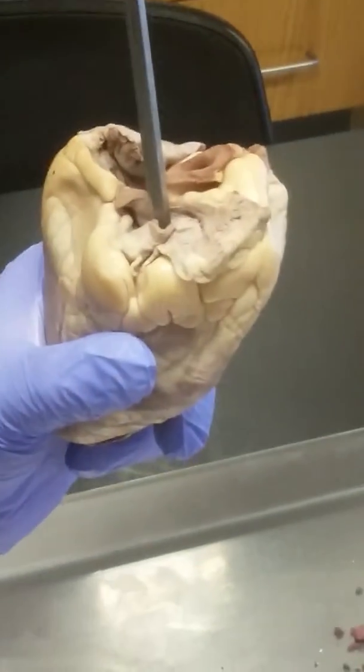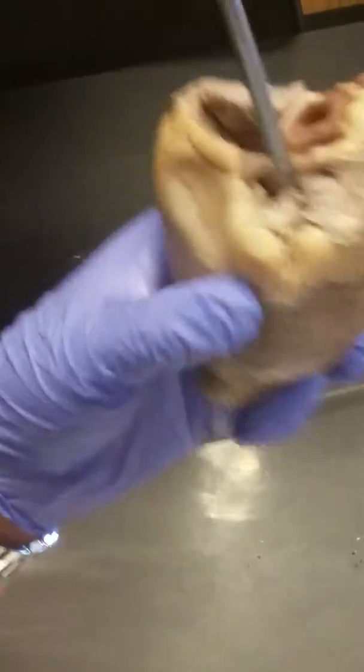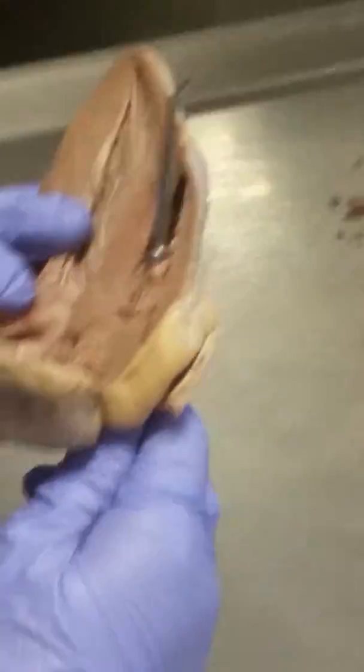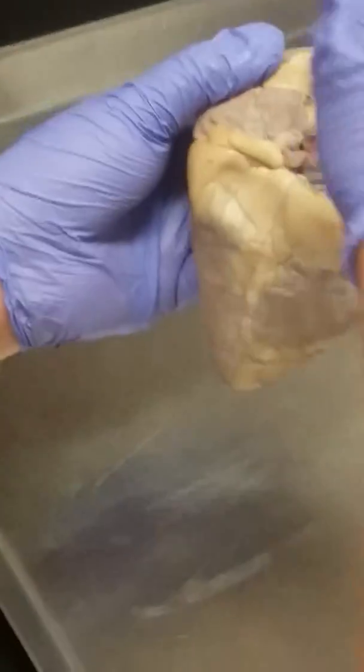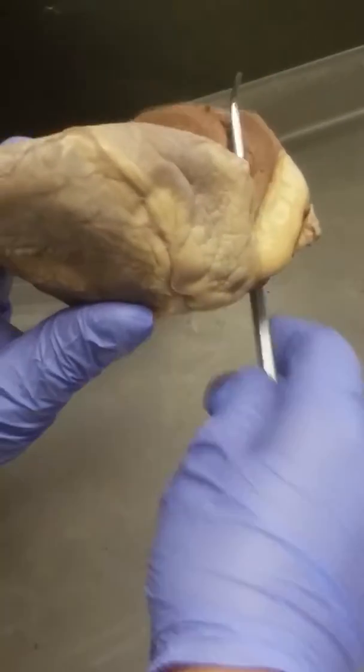Right? If I stick my probe through here, now where am I? I'm in the right atrium. Is that true? Yes, I am in the right atrium. Technically, the right atrium is all this thing that they cut out, but if I stick my probe through it, look, it's going to go into the right ventricle. Right?